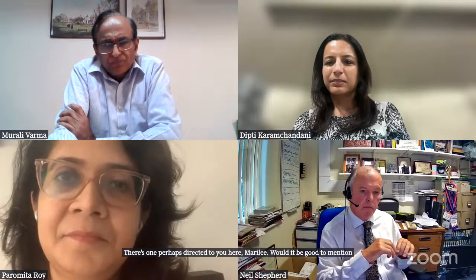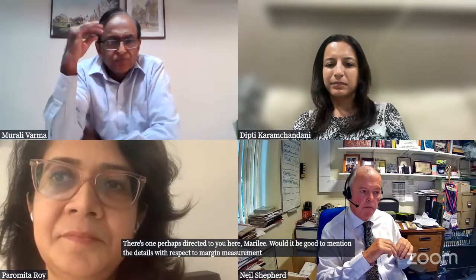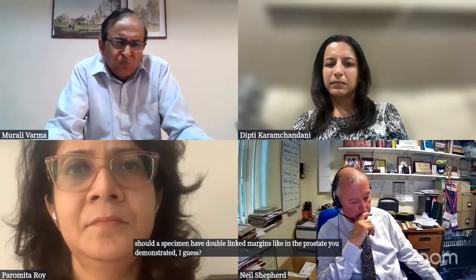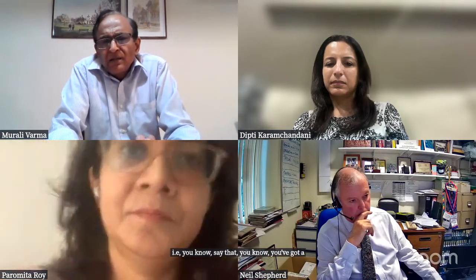There's one perhaps directed to you here, Murali. Would it be good to mention the details with respect to margin measurement? Should a specimen have double inked margins like in the prostate? Sorry, can you repeat that, Ranjan? Would it be good to mention the details with respect to margin measurement? Should a specimen have double inked margins like in the prostate you demonstrated, I guess? I.e., say that you've got a flap, etc. I think that's what he means, yeah.